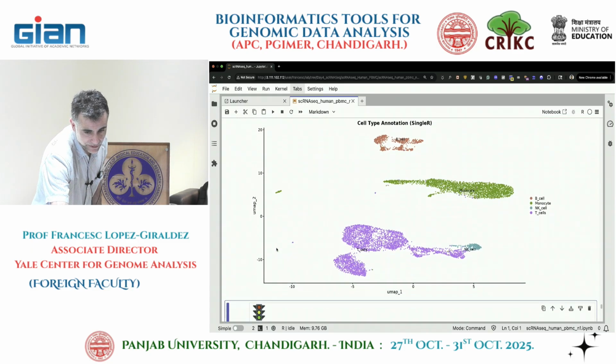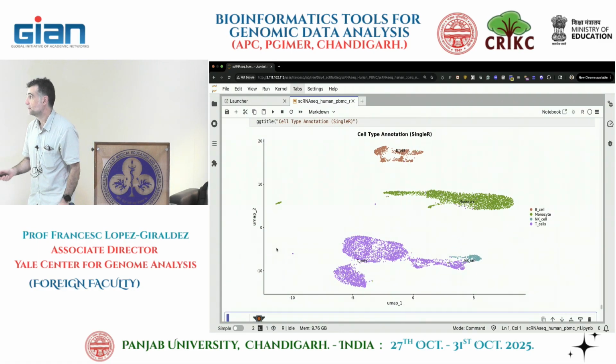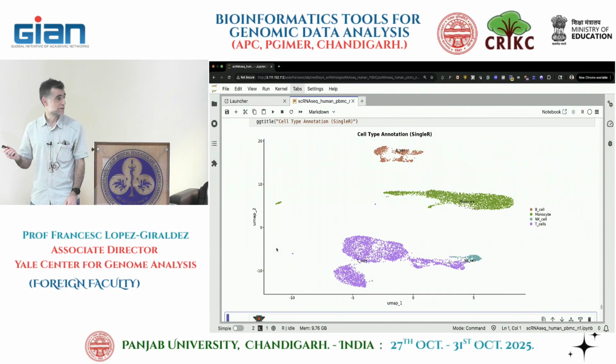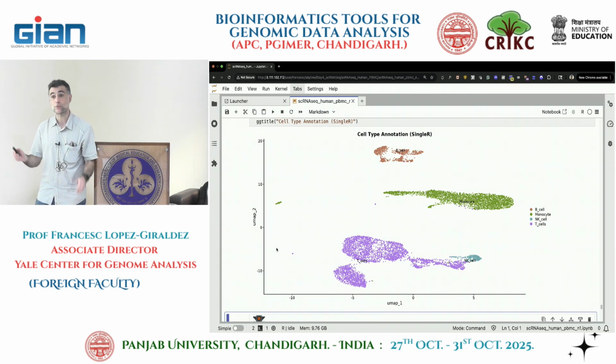So this is our results. It's quite generic, right? We said monocytes, macrophages, so this was right. Did we set B cells on top? Yes? Okay, that's good. Definitely we said these were T cells. I don't know what we said about these ones, but it classifies everything as T cells. Did we set it with NK? So we fail in that. We may fail on that. We're assuming that SingleR is doing a good job, but we don't know.